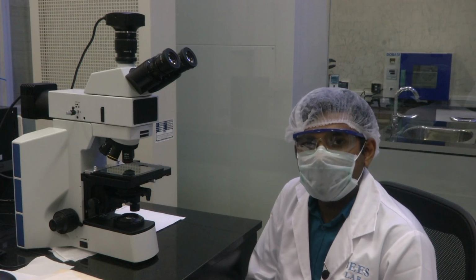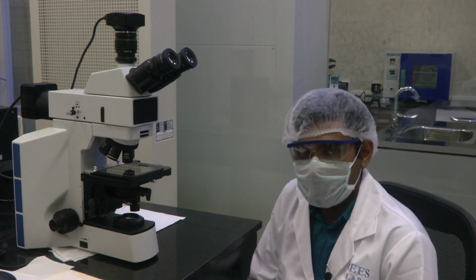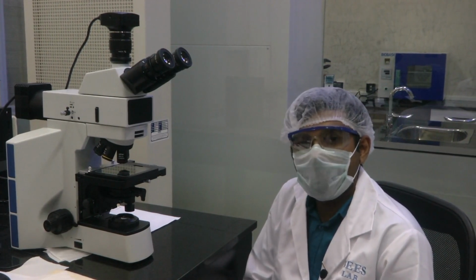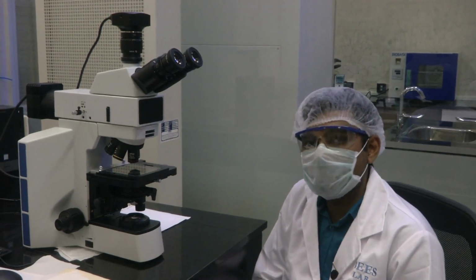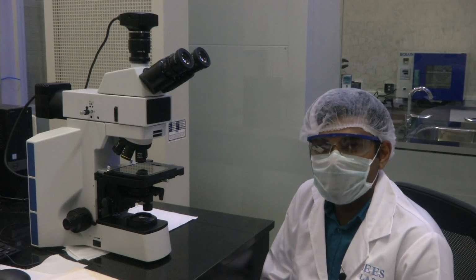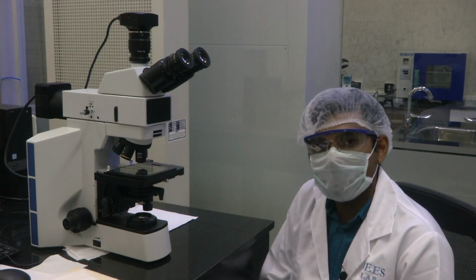Welcome. In the previous module, we started covering the basics of microscopy and how it is relevant to a course or a field in microfabrication. We went through the different types of microscopes, like optical and electron microscopy, and then within optical microscopes, the types available, like stereo, metallurgical, inverted. I went over the details of each of these very briefly. Then we covered what the stereo microscope is, how it looks, and what its utility is. Now today we will be looking at a much more conventional microscope.